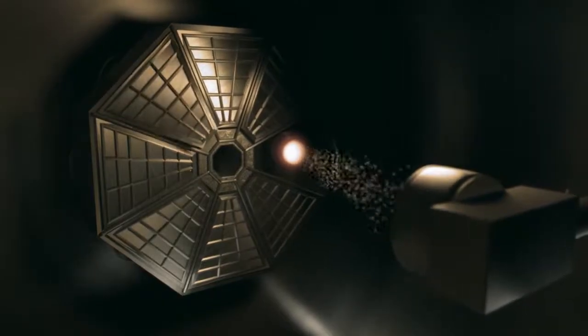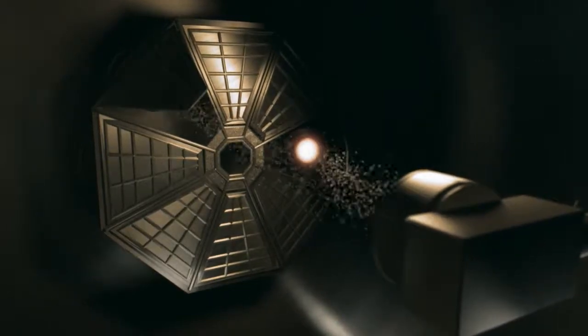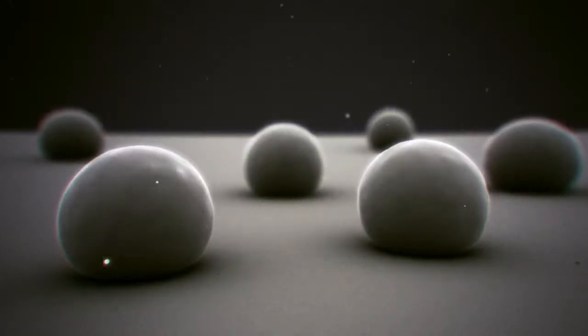At this time we now also open the flange to the arsenic source, so that both gallium and arsenic atoms are directed simultaneously towards the graphene surface. Now gallium and arsenic atoms hit and enter the gallium droplet.